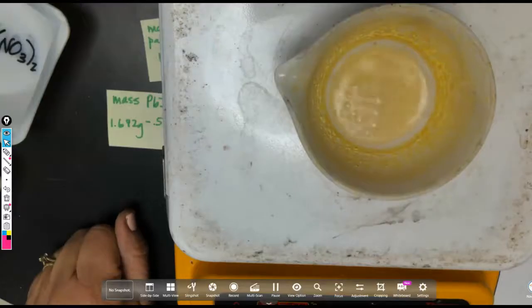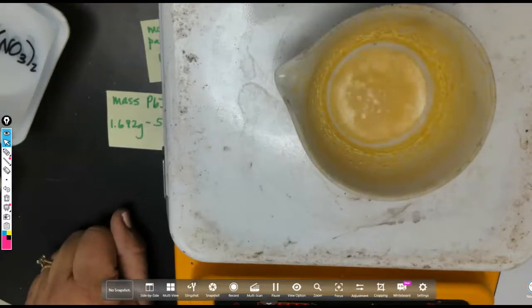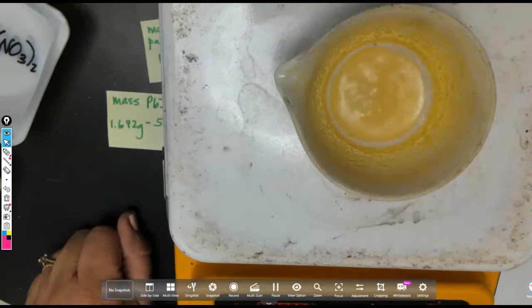Okay, as we are getting down here to the end of our evaporation, you might notice something strange and odd, and that is from that clear solution that we started evaporating, we are actually getting a residue that is both lighter yellow and darker yellow. And you can see that, in fact, even though we filtered very carefully and we thought we got all of the solid precipitate out, it does appear that we missed some of the solid precipitate.